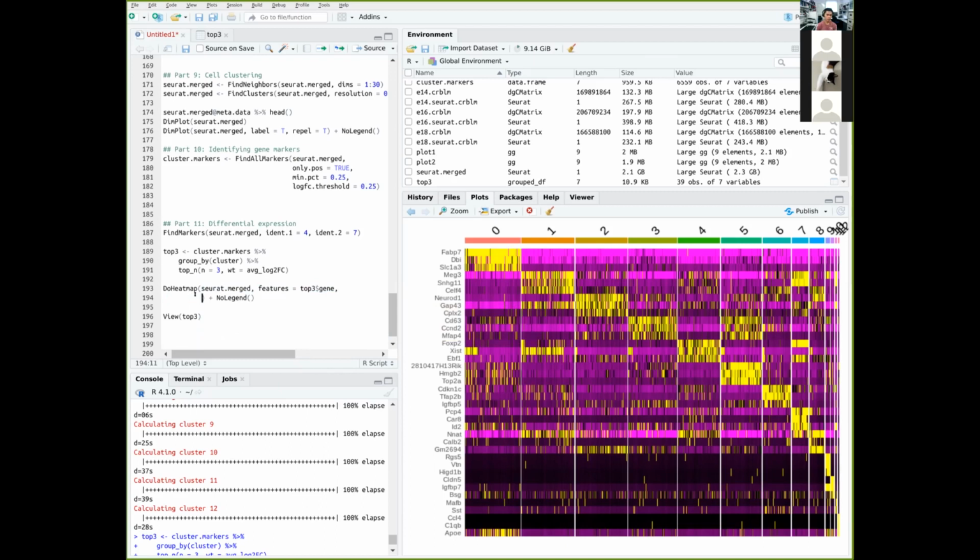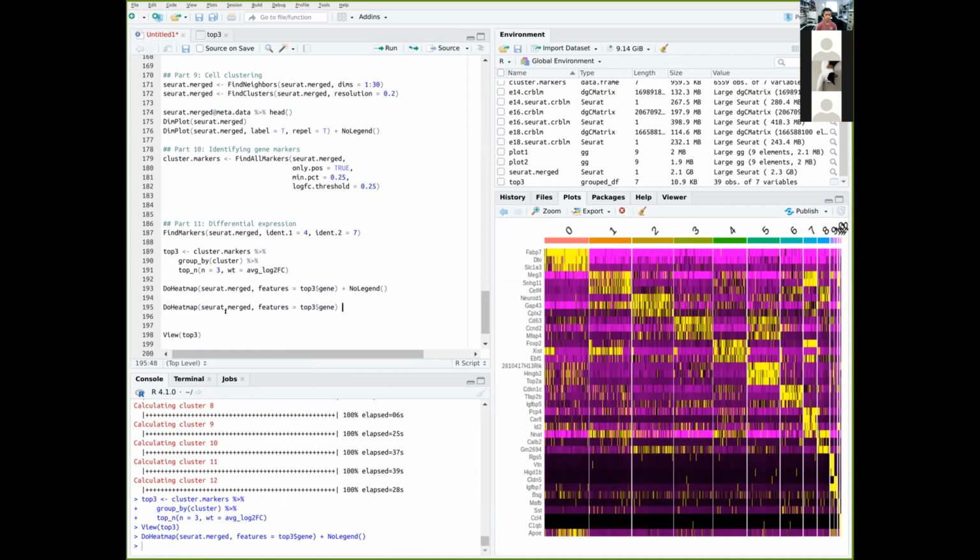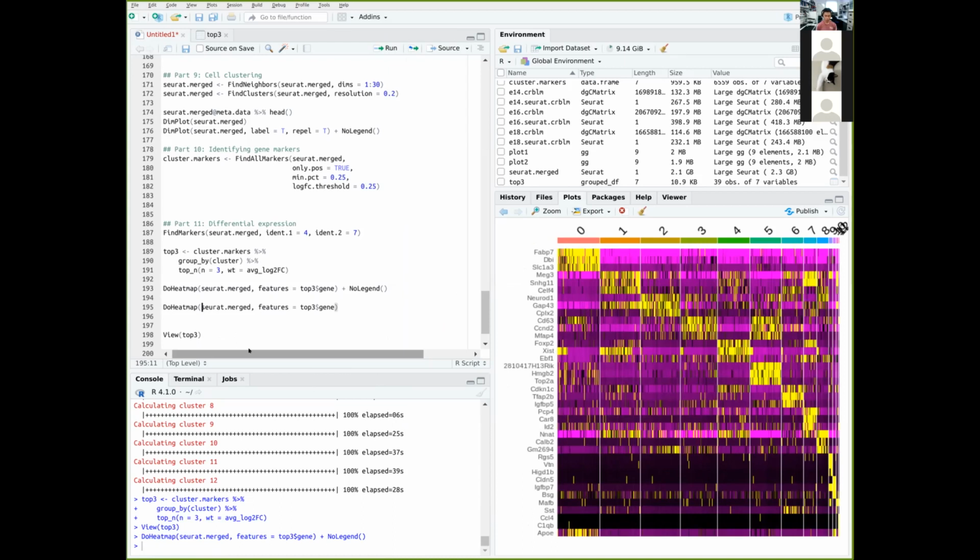These are all still R objects, and you can do a lot of manipulations to them. One thing that I can recommend, since this is very specific to a request to plot certain clusters, is to subset the Seurat object on the go. Previously we used subset to subset cells which are passing the quality control, but you can also subset based on other metadata.